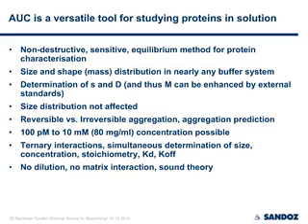You may be able to determine S and D independently, and thus you can derive the mass. You can also enhance this, as I showed you, by using external standards to enhance the precision of S and D, and thus also M. Although the size distribution is not affected, so for quantitation it's not that important, but there are reasons to of course improve the accuracy of your measured S values.